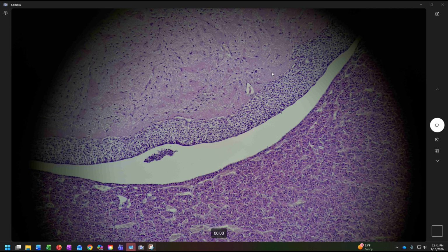But when we're talking about the difference between anterior and posterior pituitary, we're really looking at the big meaty part, the middle of the posterior pituitary gland. And here we can almost see maybe some epithelial tissue, I don't know if that would be simple or some stratified cuboidal, but again, we're looking mostly at the bulk of it.